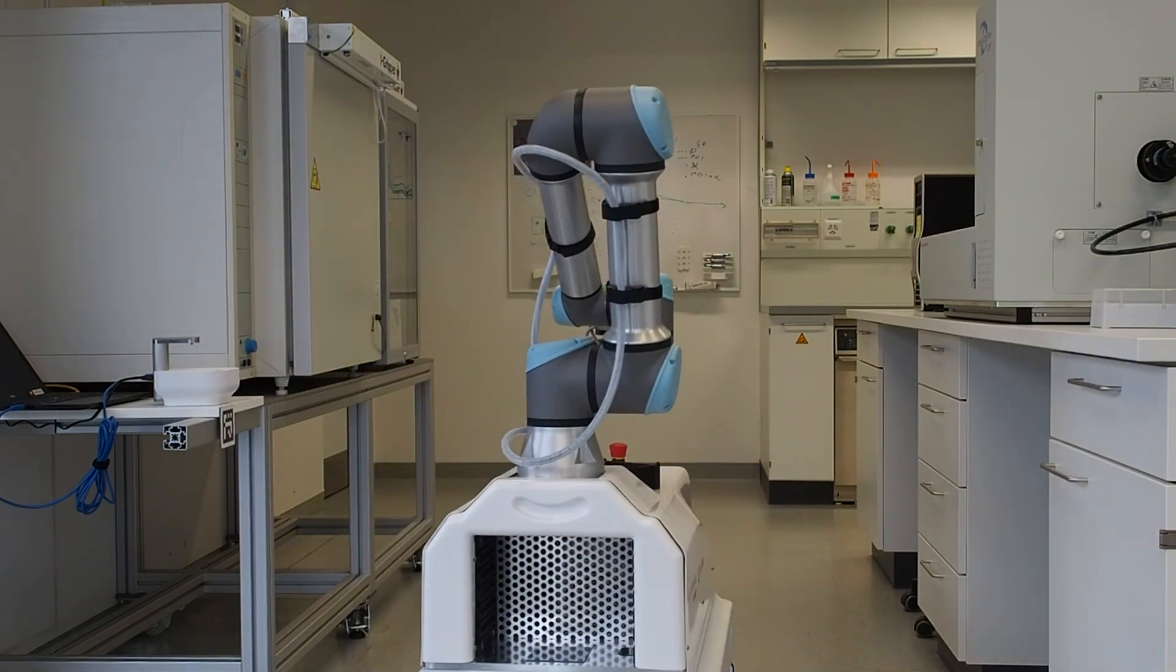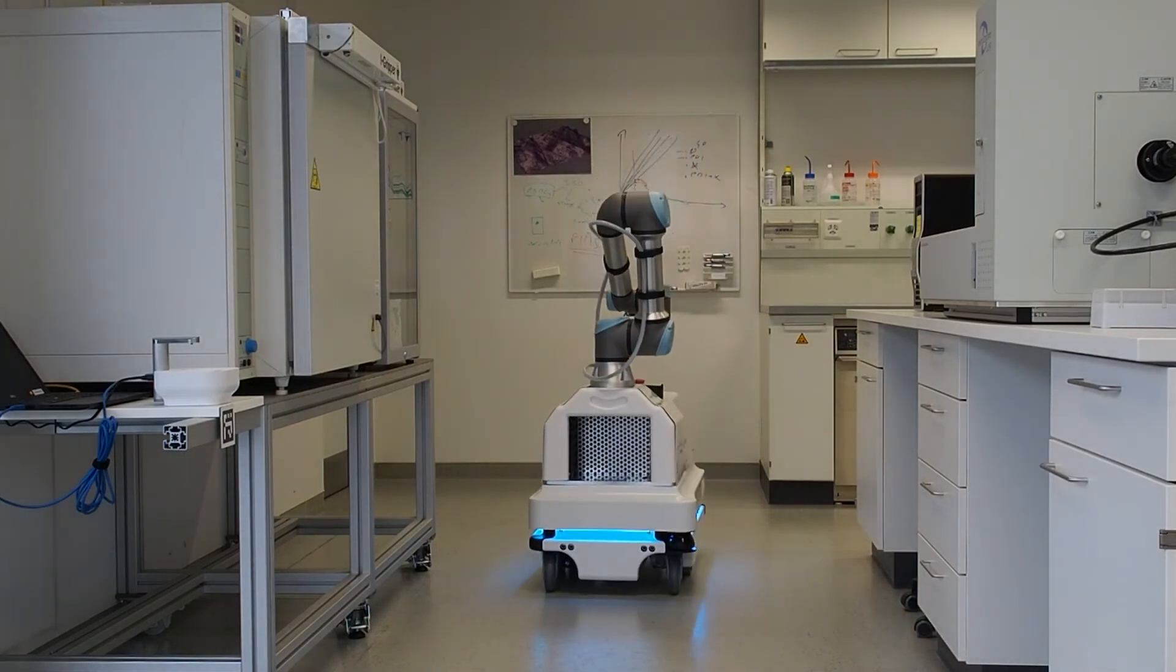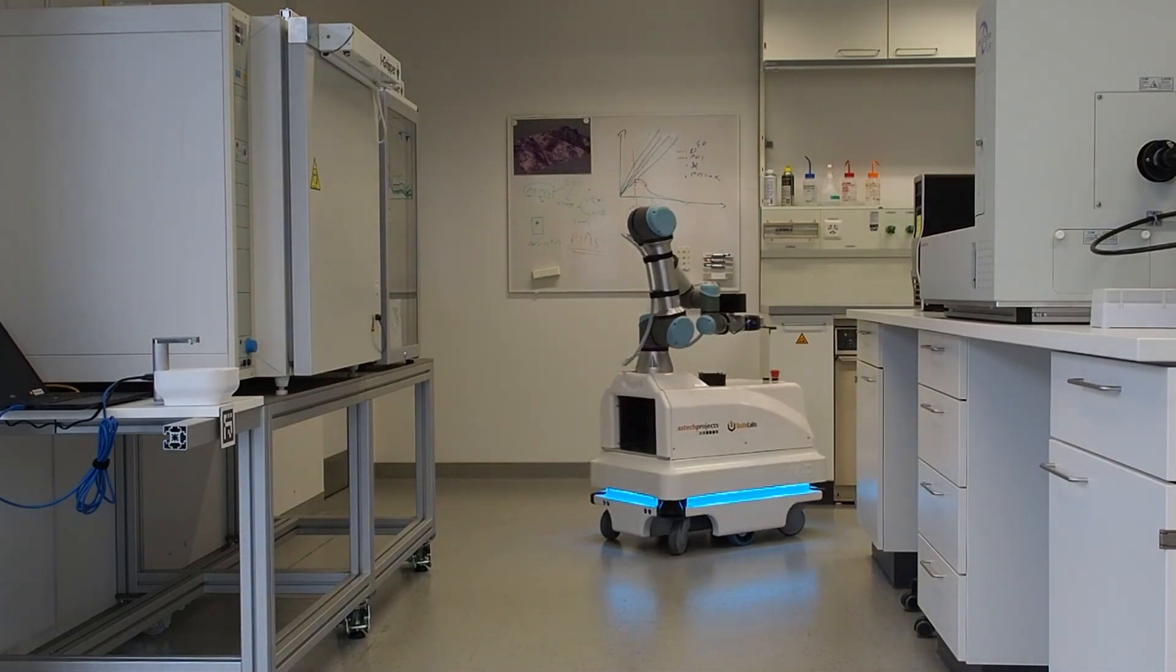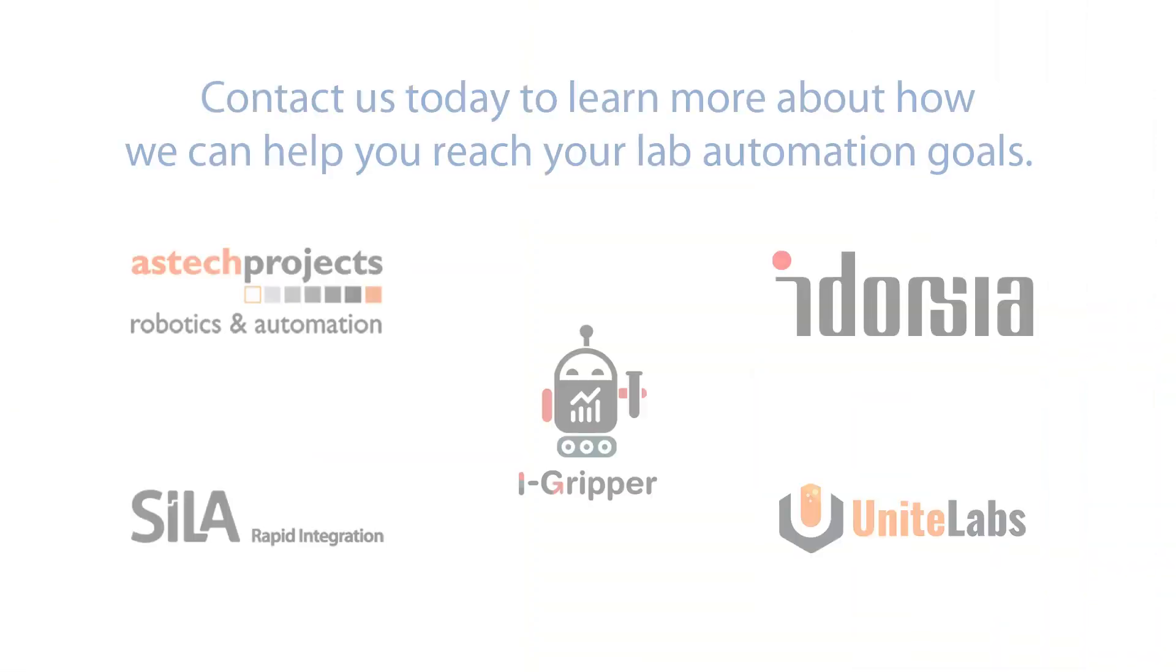The Lux 3FL is fully incubator compatible and can also be integrated into automated incubators. Cytosmart's flexible software makes it easy to integrate devices into your automated lab solution.